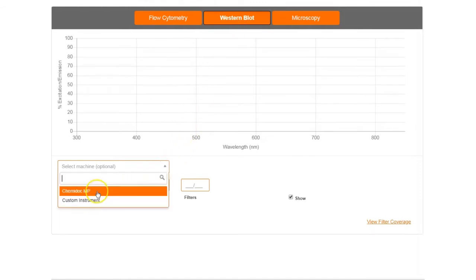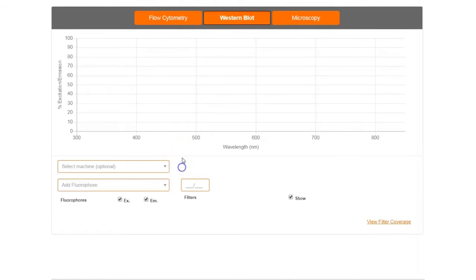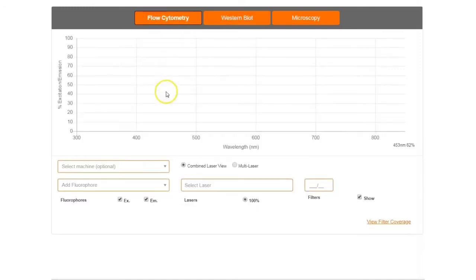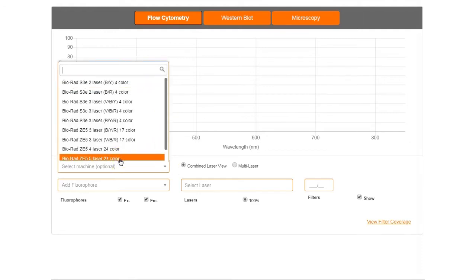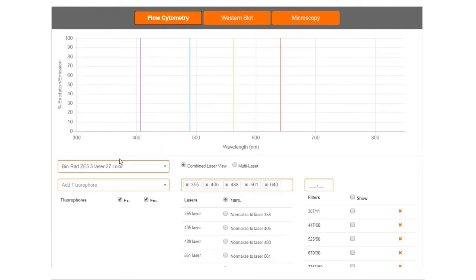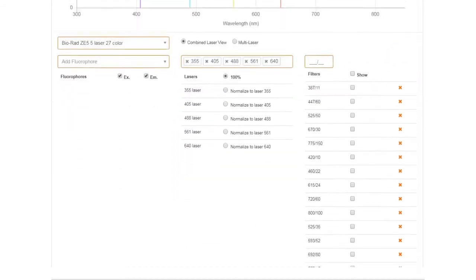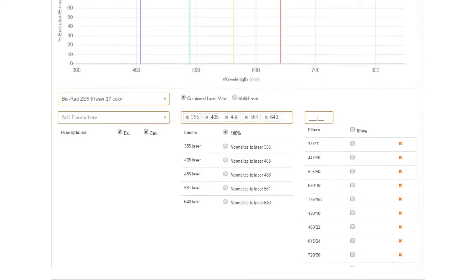Bio-Rad instruments are preloaded into the western blot and flow cytometry options. Instantly load up instrument settings by selecting your machine. Alternatively, you can choose a custom setting and manually enter your instrument details.